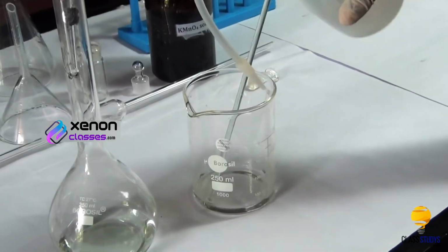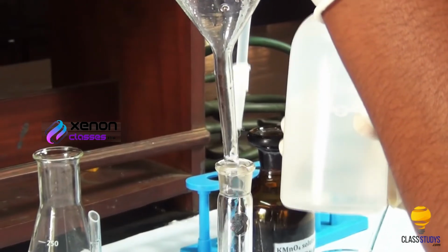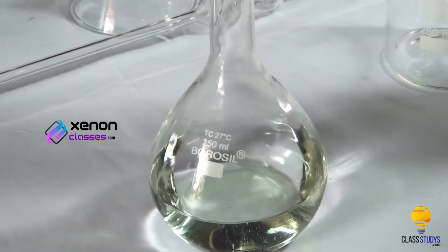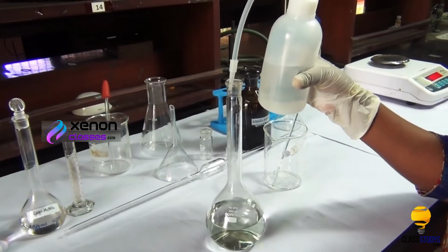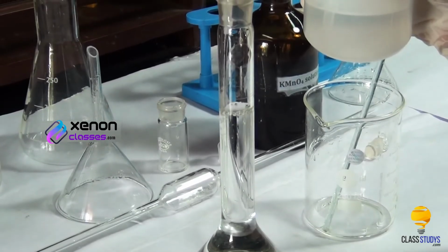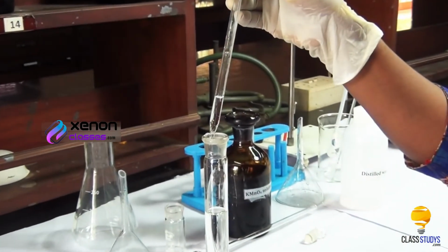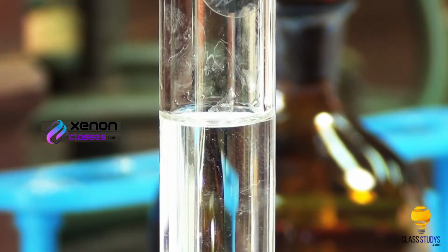Wash the beaker, glass rod, funnel and funnel tip 2 or 3 times with distilled water to transfer the solution sticking into the standard flask. Pour distilled water into the standard flask to bring the level of the solution to just below the etched mark. Then use a dropper to add the last few drops of distilled water so that the lower level of the meniscus just touches the mark on the flask.